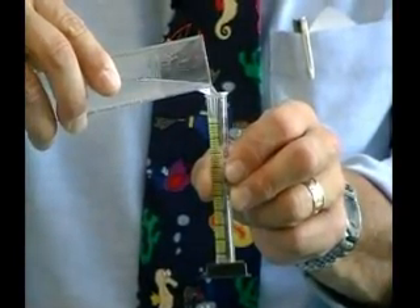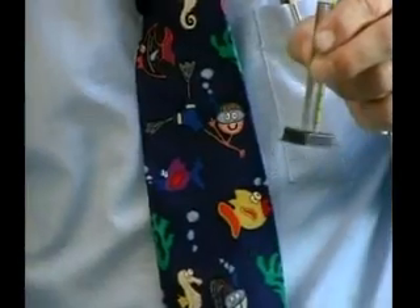This graduated cylinder will only hold 10 milliliters. Scientists and people like you use tools to solve mysteries and answer questions.